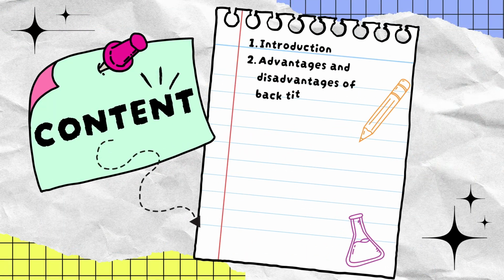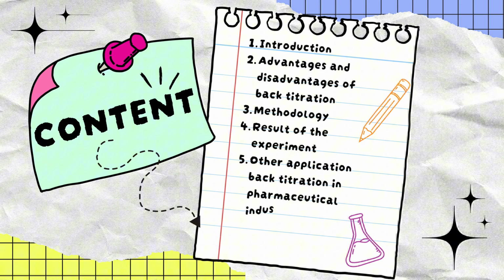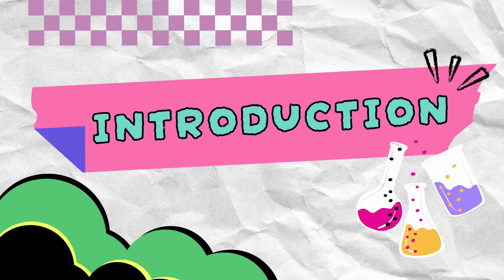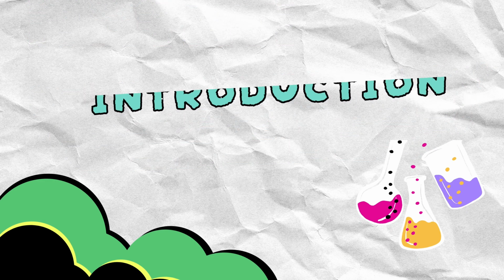Okay, let's start. This is all the content that we will be explaining to you in this video. In the next page, I will explain more about what is antacid tablet and what exactly is back titration.